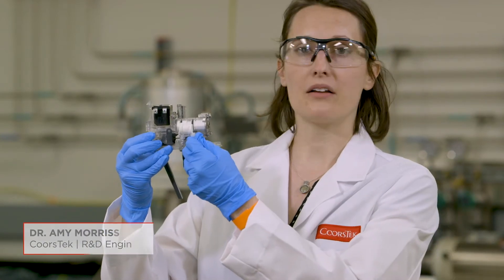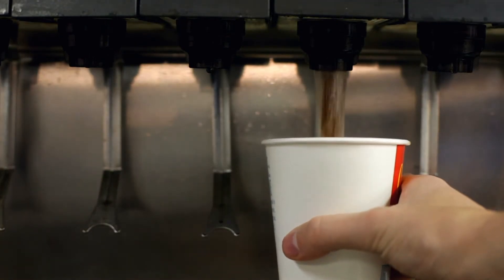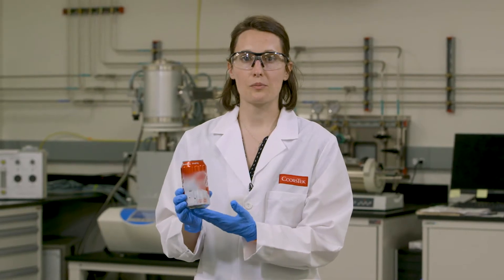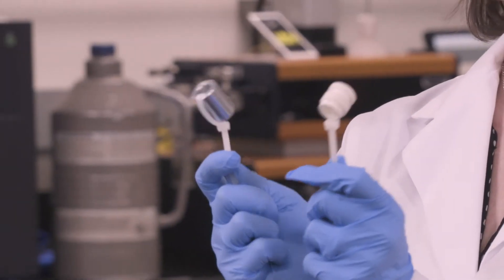This is a fountain drink dispenser, and inside this you'll find CoorsTek ceramic products. They fit about here, and the function is to mix the syrup with the carbonated water to create a tasty soda beverage. Your typical soda has a pH of around 2.5, which is highly corrosive to most materials. Today's experiment, we're going to take a metal and ceramic, go head-to-head, and see which one corrodes in a soft drink.